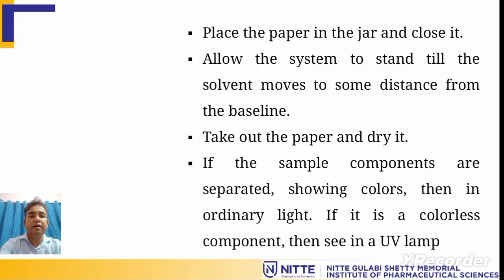And then what we do, after spotting the sample onto the paper, is place the paper in the jar and close it, and allow the system to stand till the solvent moves to some distance from the baseline. Generally the movement is till two-thirds of the paper, or slightly more or less than that, right?